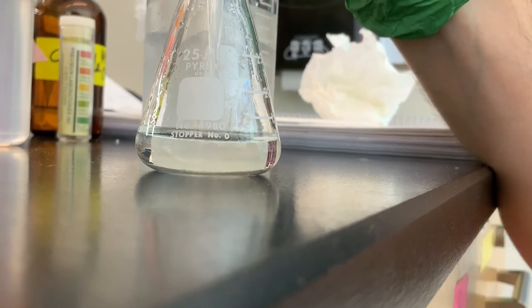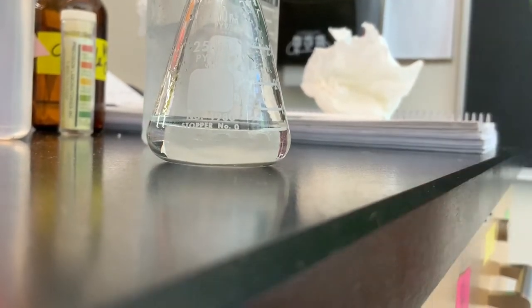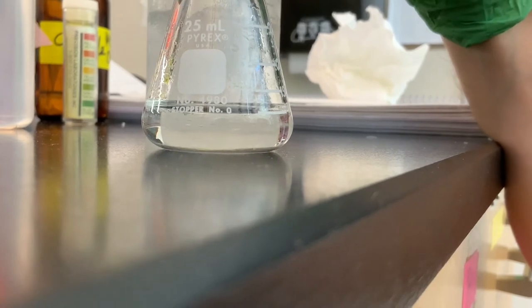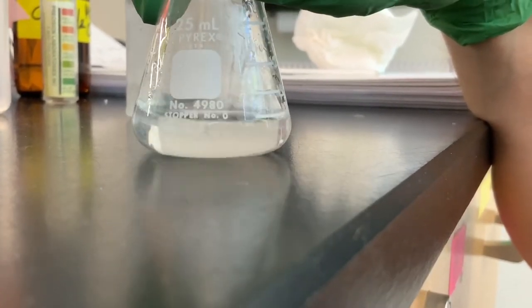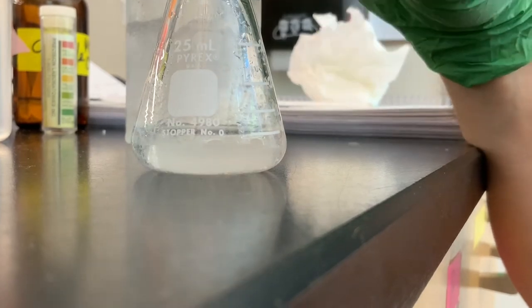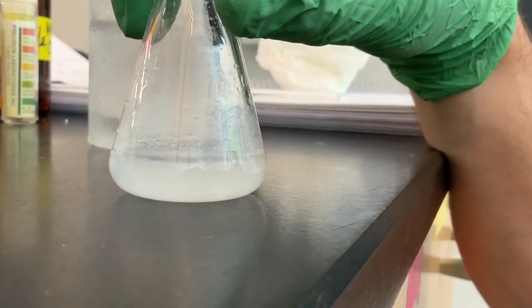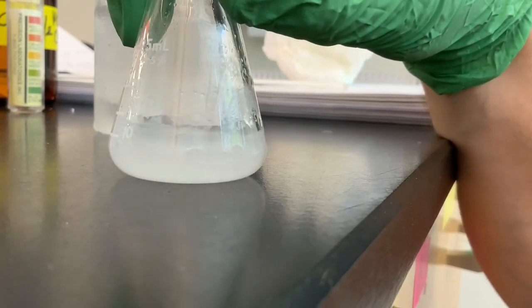Even start seeing something precipitate. I do, a little bit. And once again, let's just swirl it gently. And we see that. Now we see the solid start to form, right? So hopefully you can see that on the screen. Look at those crystals now forming and coming out of solution, right? I'm mixing it clearly together. We also see some benzoic acid start to stick to the top side of the flask here. But just upon swirling now, I've really mixed the two, and benzoic acid has precipitated out of solution. So once we measure the pH again, it's gonna be much lower because now we've protonated all of the benzoate and we have the native carboxylic acid, which is water insoluble.